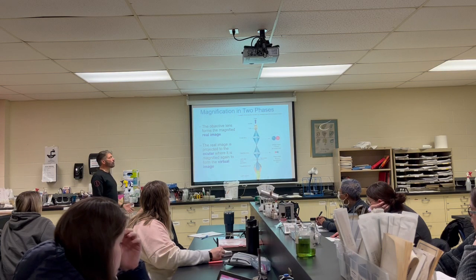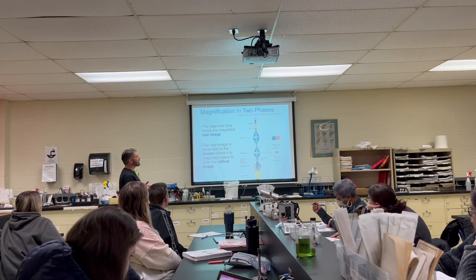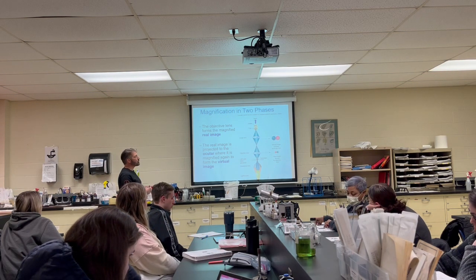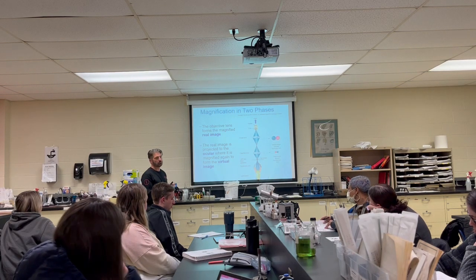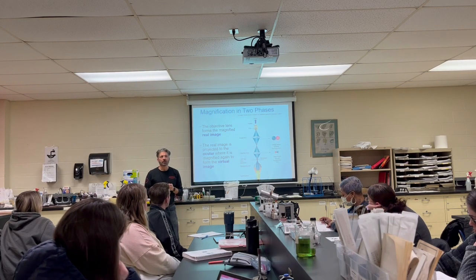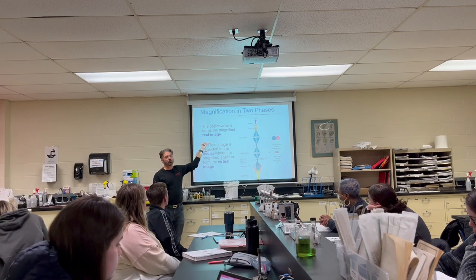They could ask you a question in the future about the objective lens forming the magnified real image. So when I say objective lens, how do you think they come up with that name? Because it's next to the object. It's the objective. And the eyepiece or ocular is where you put your eye in.